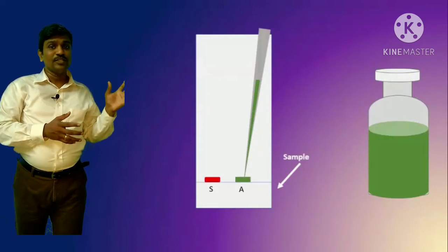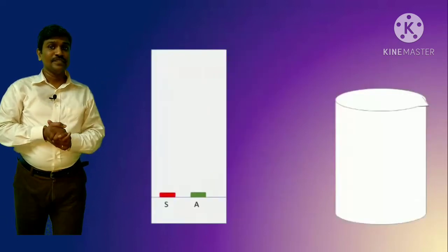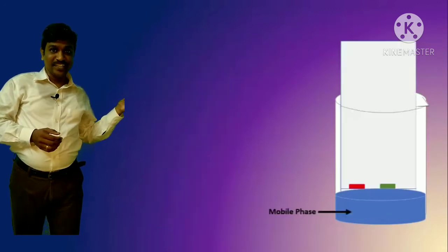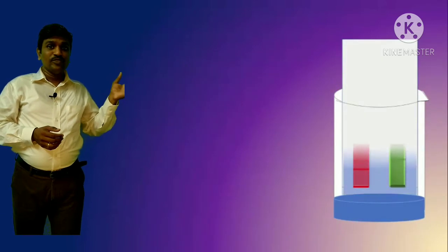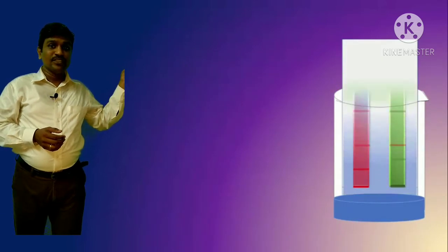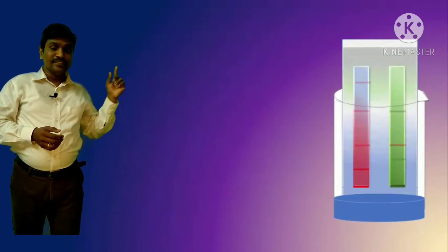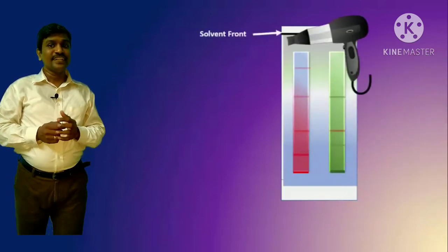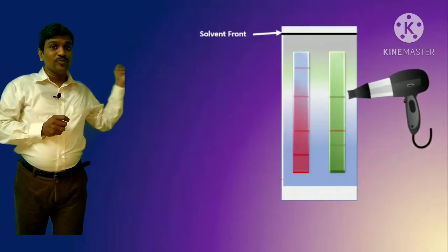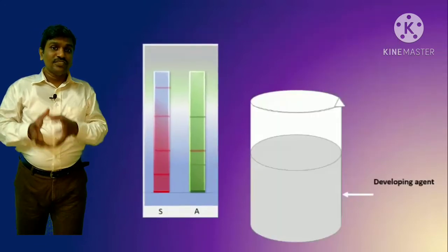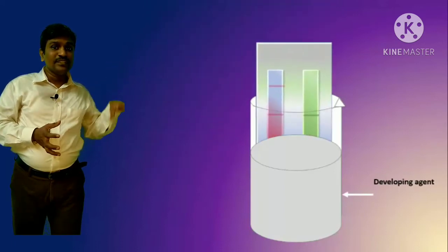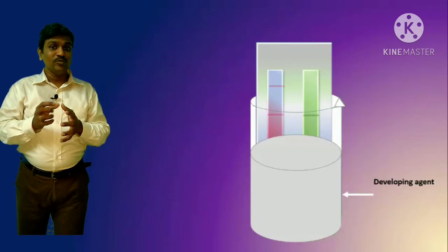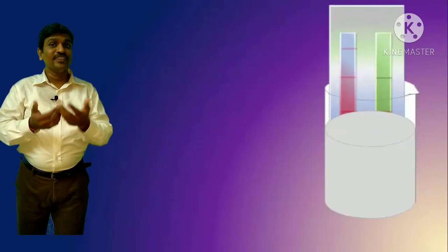Place the plate in the beaker containing the mobile phase and it will run automatically. You can see it running here. Let it run until three-quarters of the plate or up to a certain mark has been reached. That certain mark — the three-quarter distance — is known as the solvent front. Then remove the plate and dry it, marking the solvent front with a pencil.